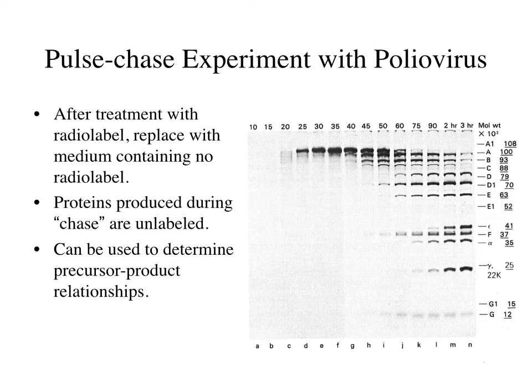The reaction is monitored to see how long it takes the labeled form of the compound to be replaced by the unlabeled form. There are many ways to label a compound for use in a pulse chase experiment. Radioisotopes or fluorescent labeling using compounds such as green fluorescent protein are both popular. But in this gel that you see in the slide, an early pulse was used, and then they followed it over time. You can see at the top the hours.